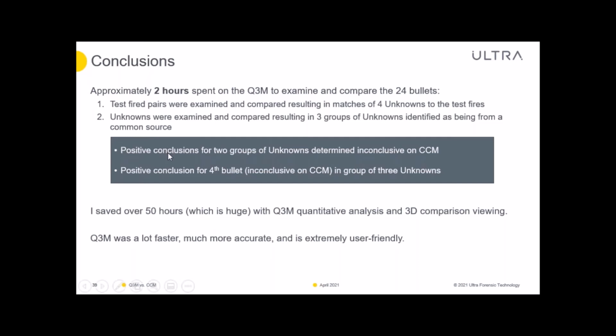The positive conclusions for the 2 groups of unknowns I determined as inconclusive on a conventional microscope. And also the positive conclusion of the 4th bullet that was made inconclusive on a conventional microscope.